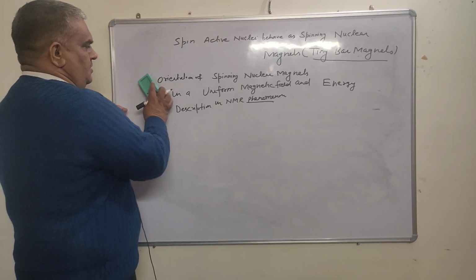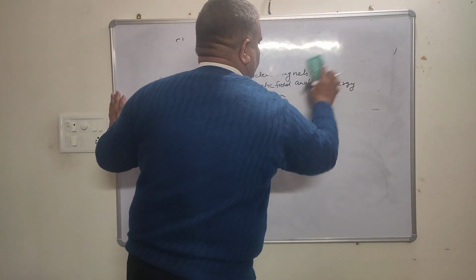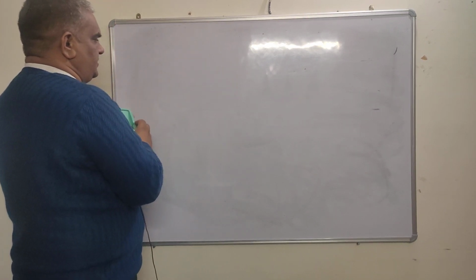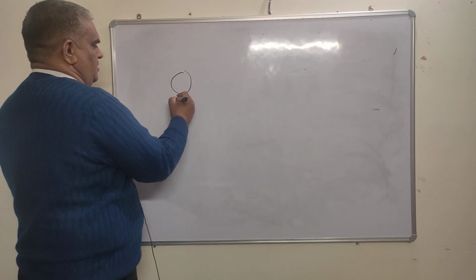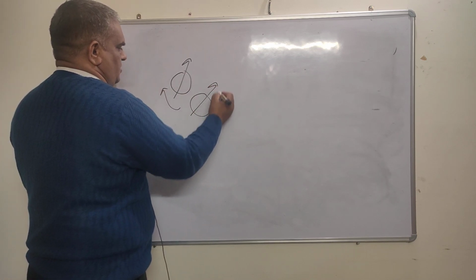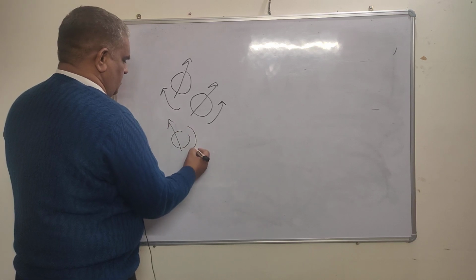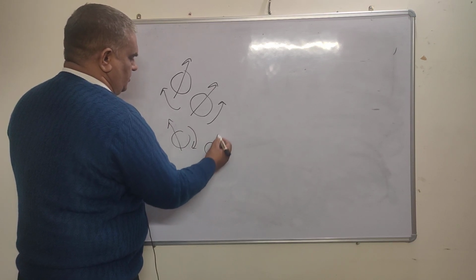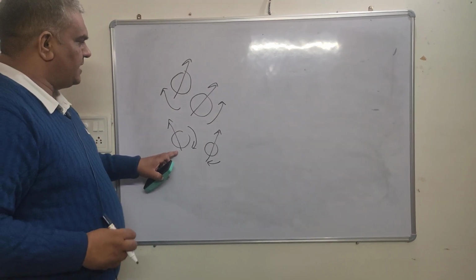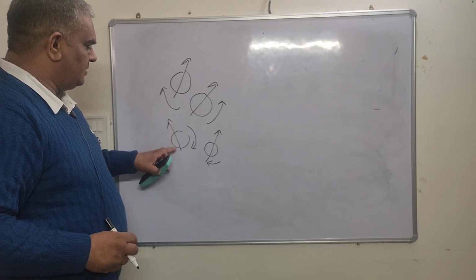This is about the orientation of spinning nuclear magnets. These are the spinning nuclear magnets.